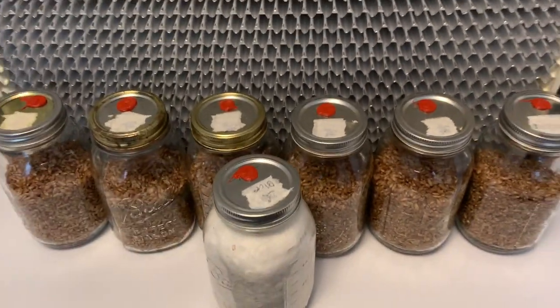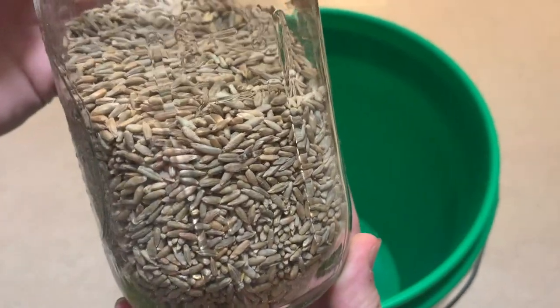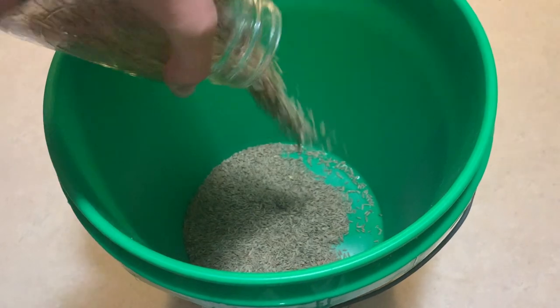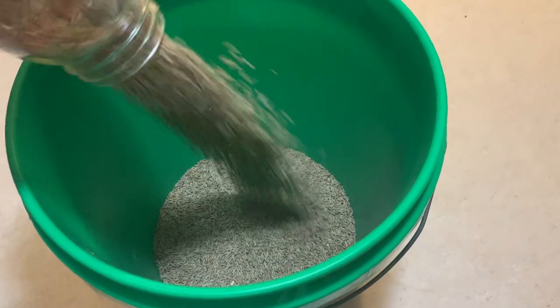The first thing you need to do is to prepare some grain. In this example I will be using rye berries. You will need to measure up some grain to be soaked overnight. This will germinate any endospores and allow them to be destroyed during sterilization.